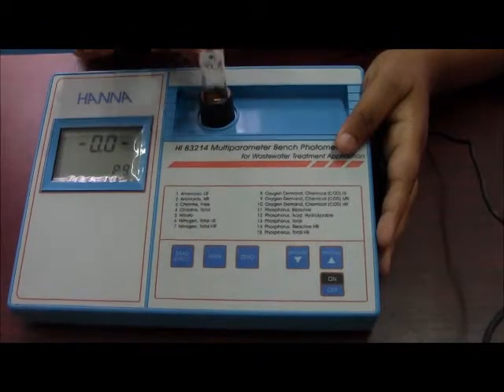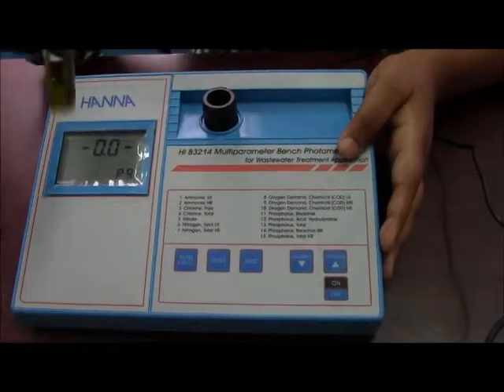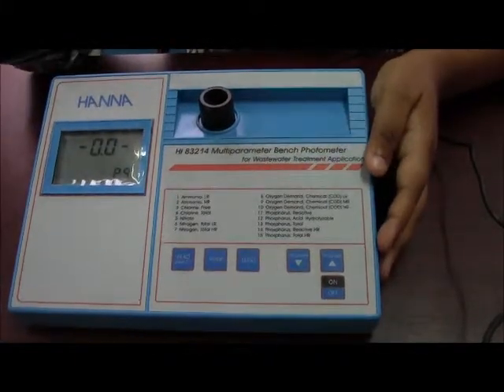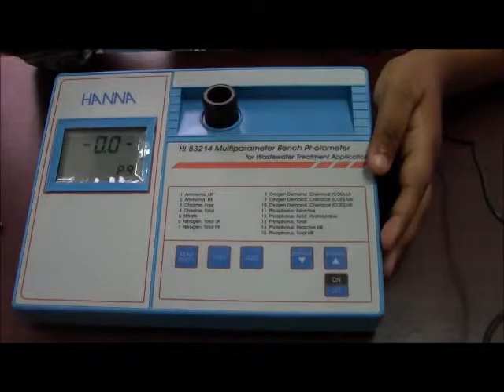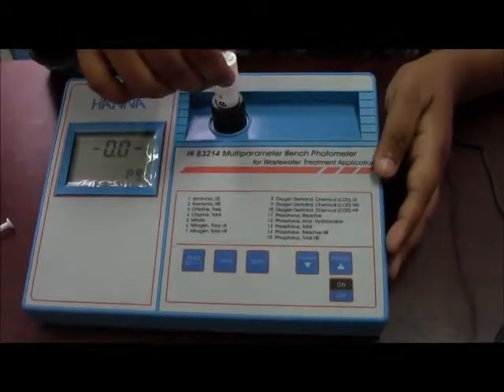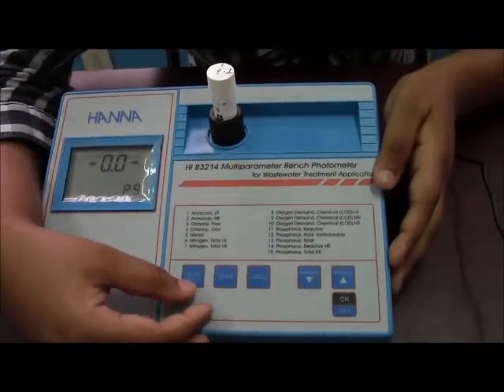Once it is zeroed, we would read our sample now, which also has 2 ml of sample in it. It has been digested at 150 degrees Celsius for 2 hours. We would now press the read button.